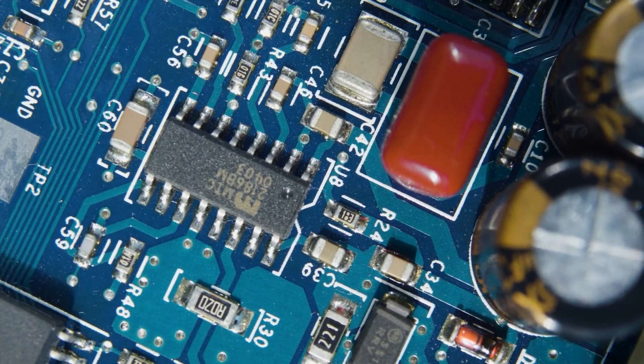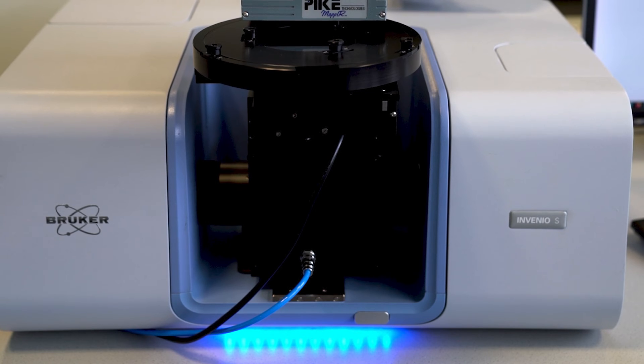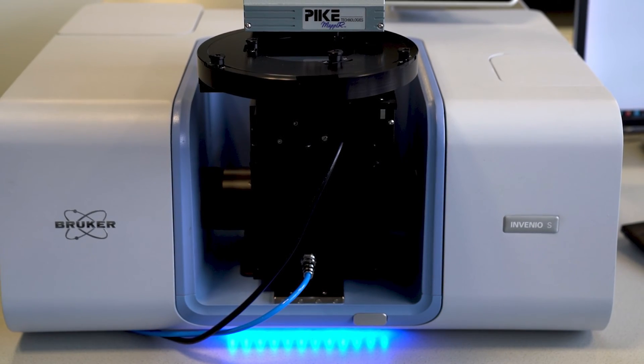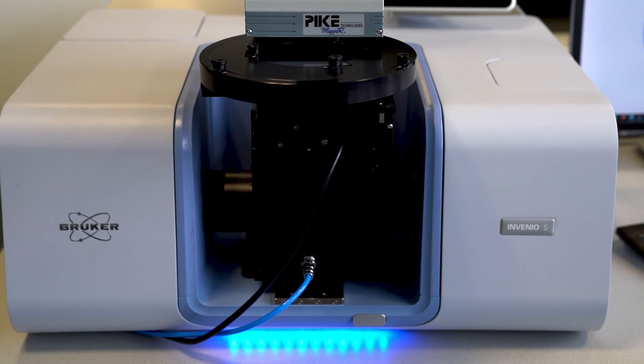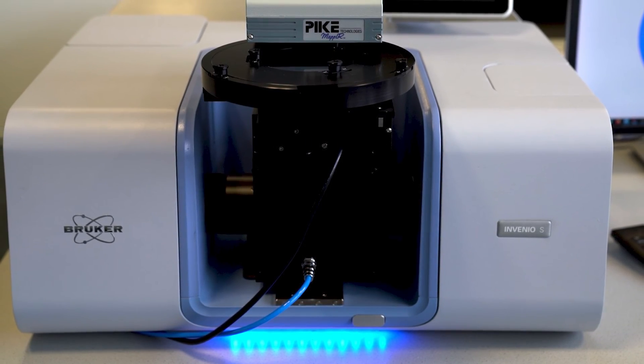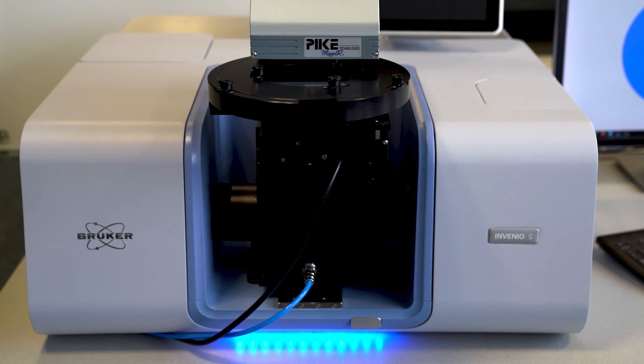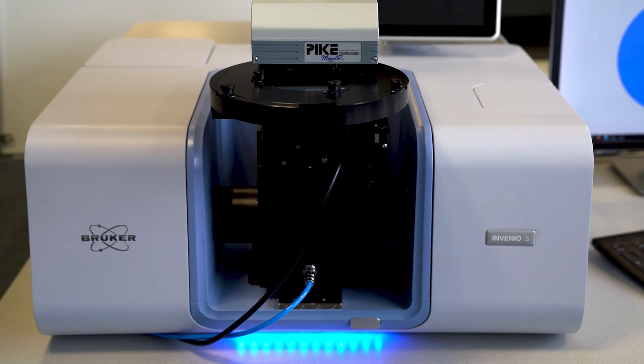Today we'll be using the Invenio FTIR spectrometer for one of these QC steps: checking the interstitial oxygen and carbon content.